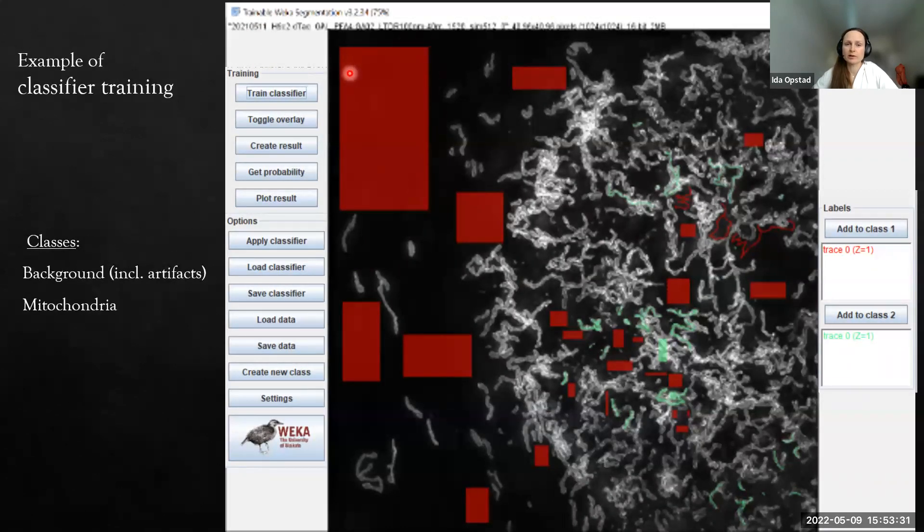This is an example of how the interface looked like and how I trained my classifier. There are two classes: dark red for background and green for the mitochondria I want to classify. To make sure all these artifacts are recognized as background, I put a lot of red pixels in this class to make sure all these artifacts here and between those regions are properly trained in that class.